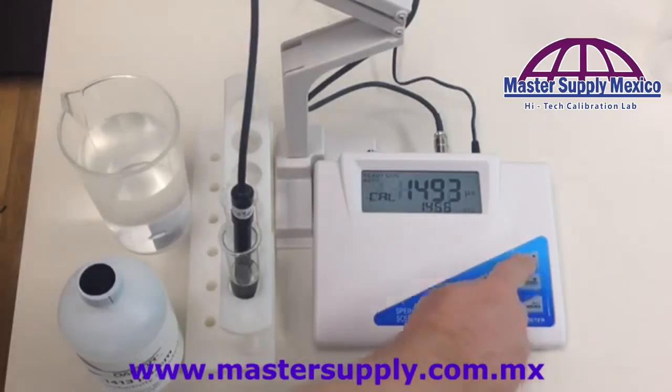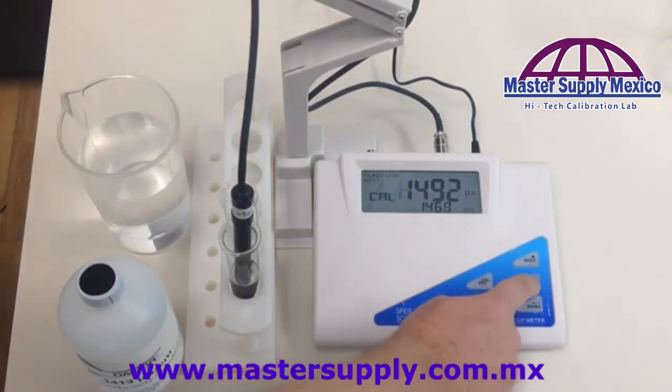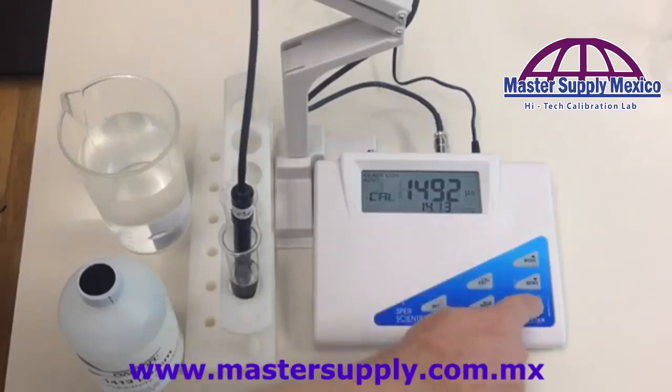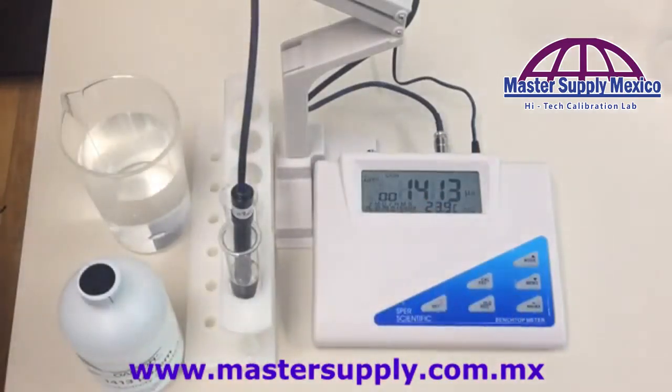I'm going to go down to reach 1413 — you can use the up button if you need to go up, but I need to go down. As you can see on the second sub-screen right here: 1413. I hit the confirmation button, and now you can see it's reading at 1413. This meter is now calibrated.